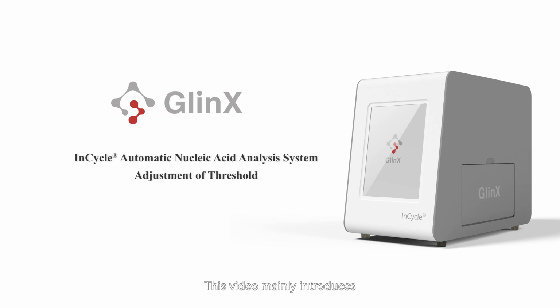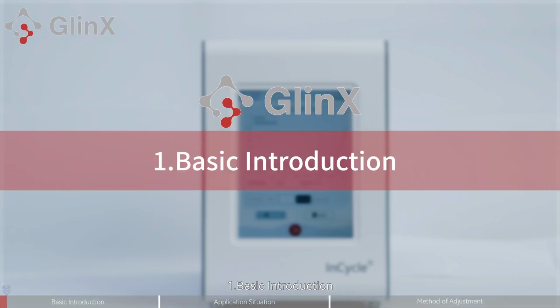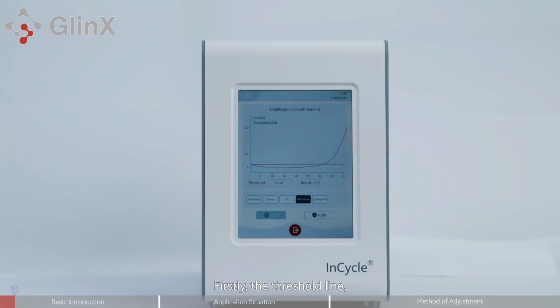This video mainly introduces the threshold adjustment of InCycle nucleic acid analysis system. 1. Basic introduction. Firstly, the threshold line, amplification curve, and CT value are introduced.